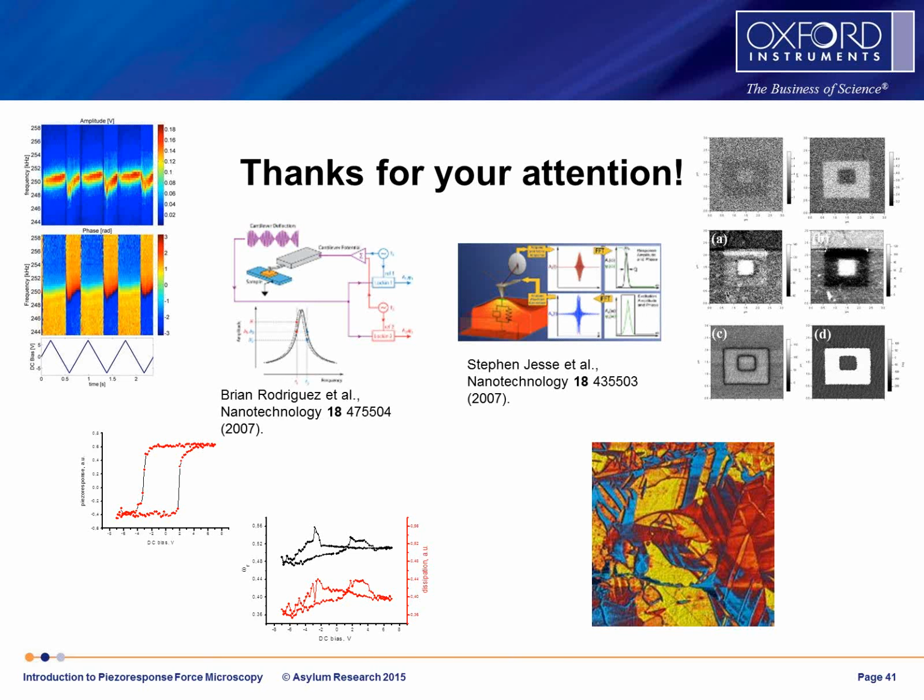Well, there are many sorts of noise possible, right? I'm sure that Roger would be able to add to it quite a lot, but our background noise is the basic thermal noise in the system. This is typically white noise in its origin.